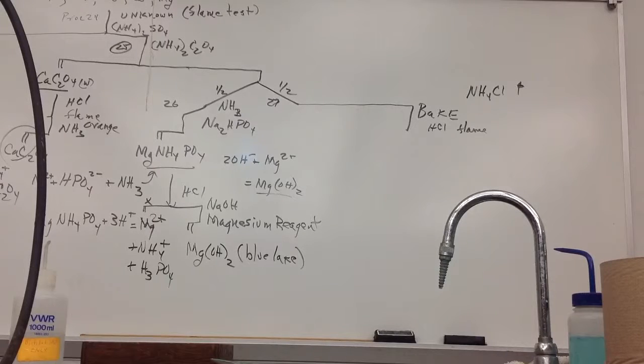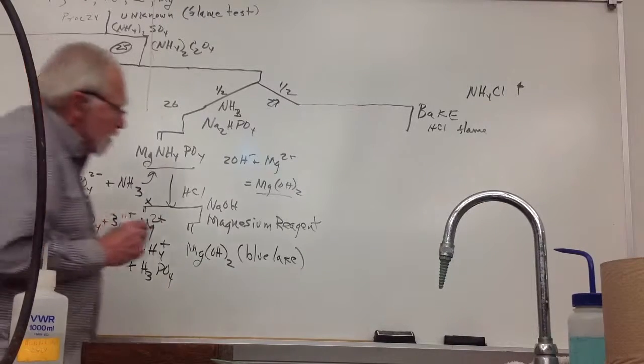Says I'm over here in note 5 on page 235. You allow the solution which the flame test has been done on to evaporate to dryness, cool, and again, as I said, bake. And the reason it says cool, what happens if you put cold water into a hot casserole? Crack. Buy a new casserole, right? Which you don't want to do. So it says allow to cool. Then you add 3 or a maximum of 4 drops of water. You don't want to add too much.